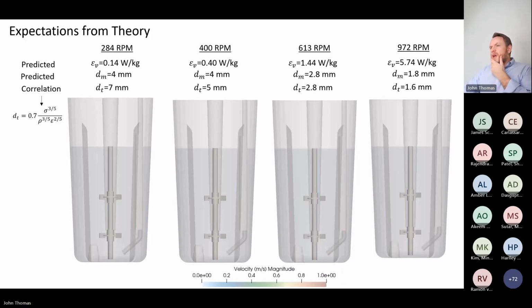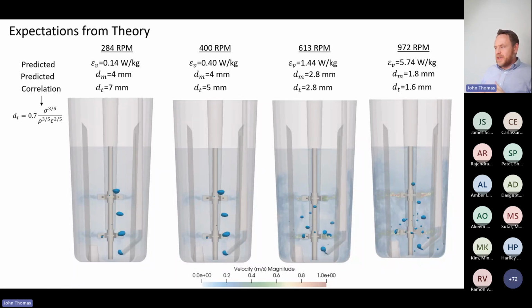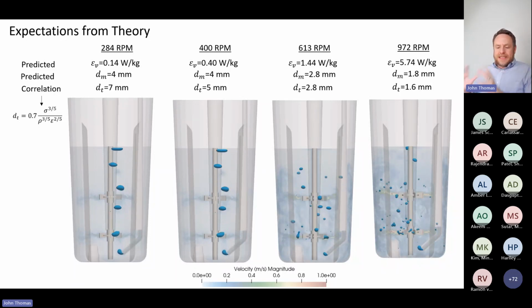But if you pay that price, your reward is generality, as it were, which is really useful for these types of systems. Okay, and now as we get these physics out, we can start to understand and see how they compare against, say, first principles theory. So here I've got 4 different impeller speeds, and we can see the generality of these models as a function of operating conditions. Now, it's the same physics in every model.